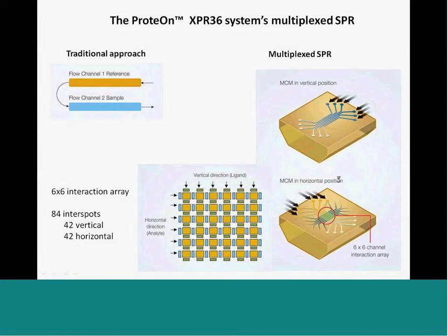In comparison to standard SPR machines, which can be seen on the left side, in the standard approach the determination of kinetic rate constants has been run sequentially using two flow cells, where one is a reference and one is for binding interactions. The reference cell didn't contain any ligand and served to measure non-specific binding of the analyte to the surface of the chip, bulk effects, and signal drifts.